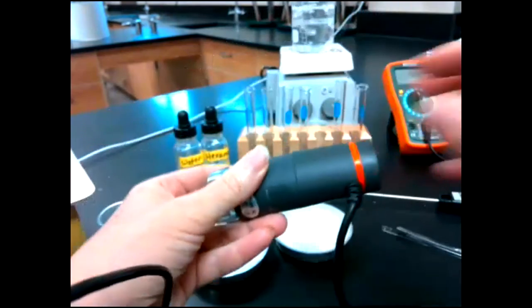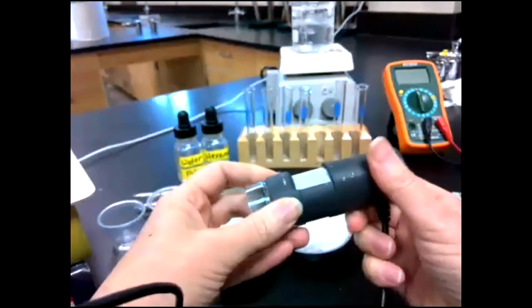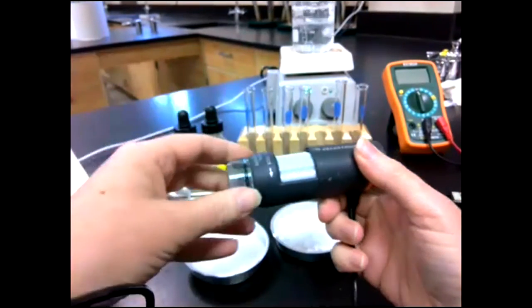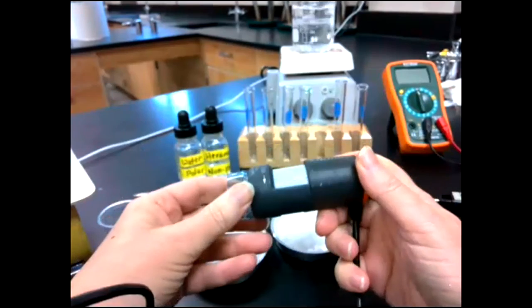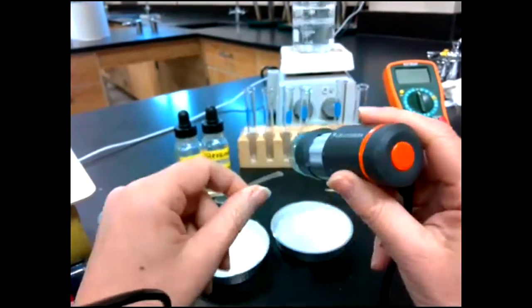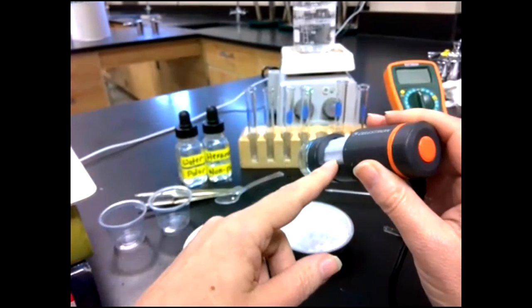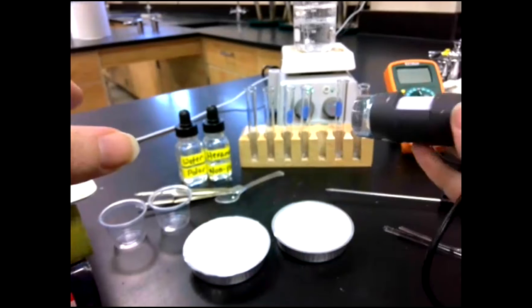Did you guys use these in biology? Or did you guys use real microscopes, right? Don't you have real ones in bio? Yeah. Anyway, this is a kind of a cheap version of a microscope. It's pretty good. It's only like 20 bucks on Amazon. It works pretty well. And I will project the image onto my computer and share my screen.